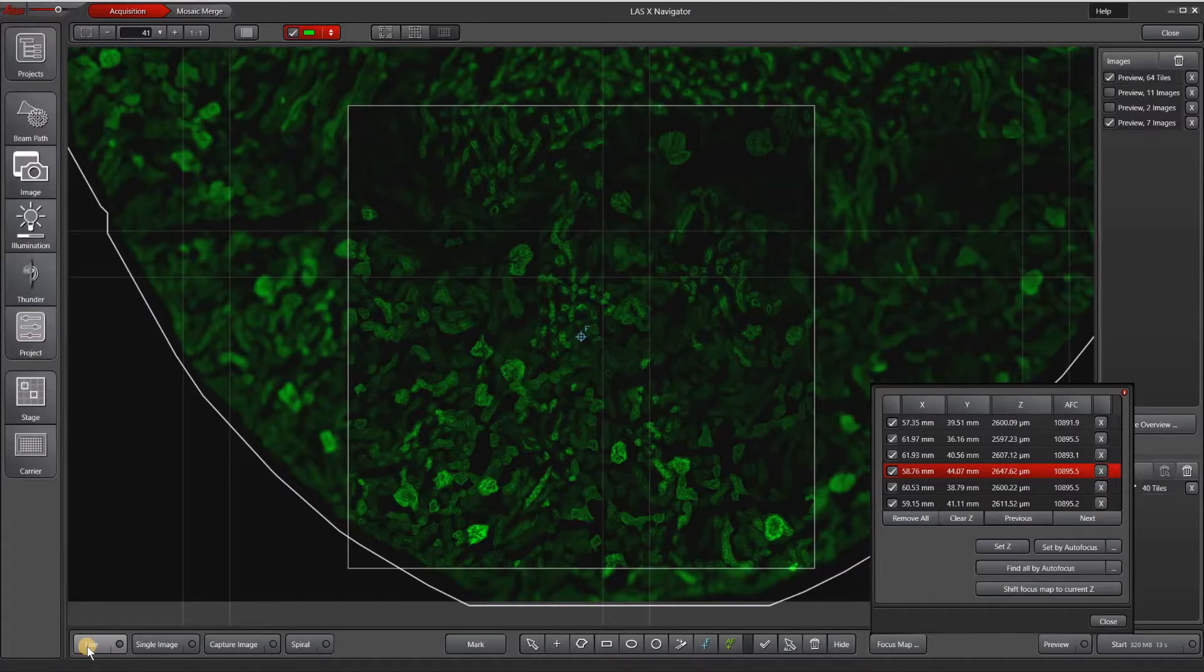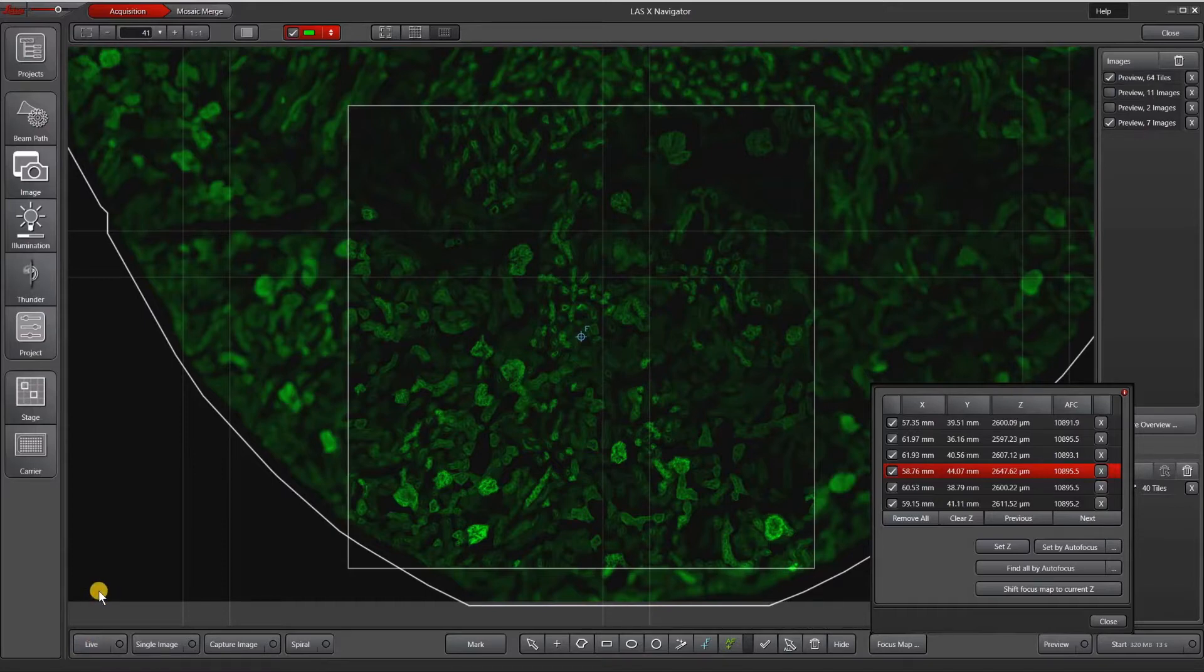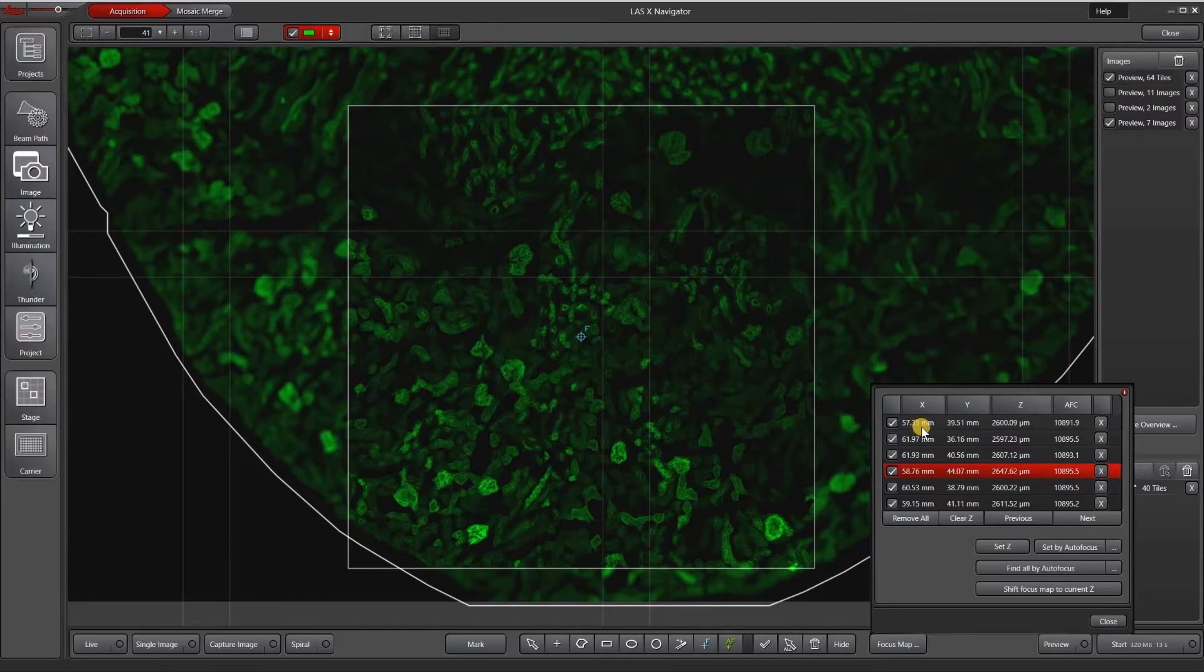In the future, if I'm working with these kind of tissues again, what I might do is increase my range to 60 microns or so to make sure that I get the full range of my tissue. When I have the focus map point set, let me close this and then I will hit start.